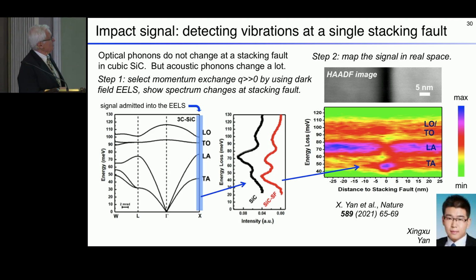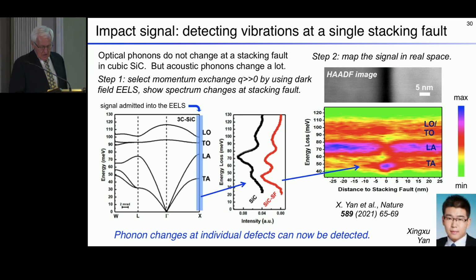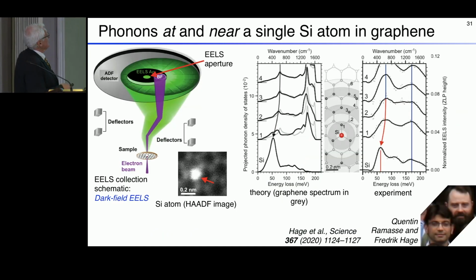Optical spectroscopy would not get us anywhere near the resolution that we need. With electron microscopy, we don't have atomic resolution for this kind of selection, but we have a couple of nanometers spatial resolution, and that's quite interesting. Now, if we give up on the idea of having good angular resolution and angle integrate a bit more, we can keep the atomic resolution.